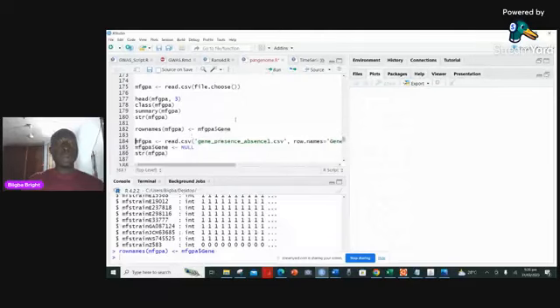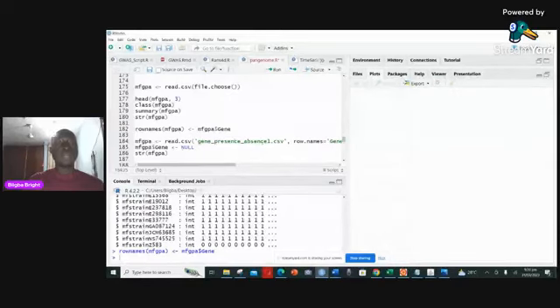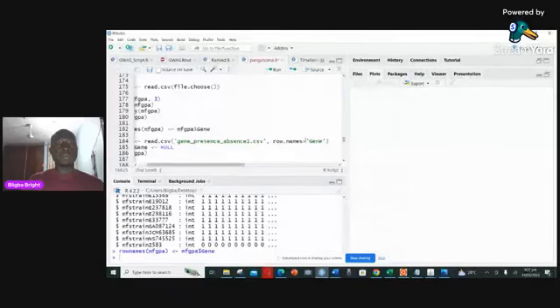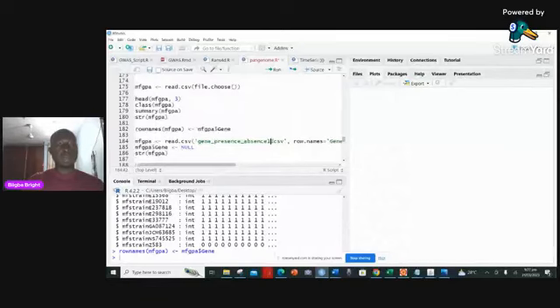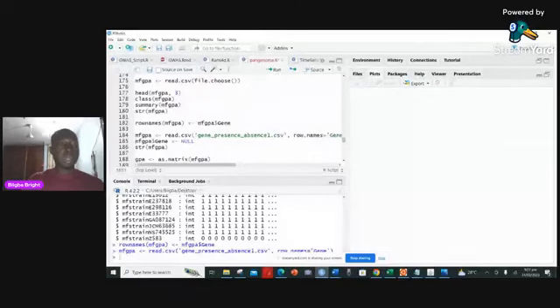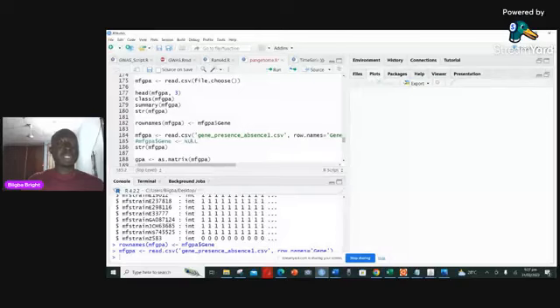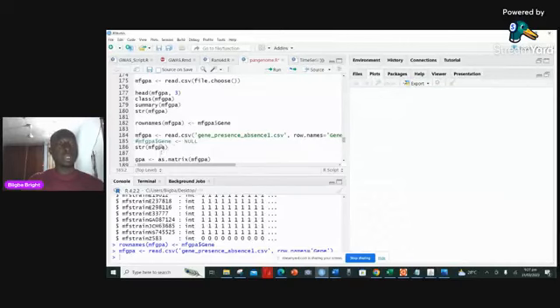Another way of doing what I just did is by running read.csv directly with the row.names argument — specifying that the first column called gene should be the row names so it doesn't form part of the data. When you run that, it runs properly. Then I comment out the previous approach. You can also select that column and remove it using NULL, which will simply remove it from the data set.